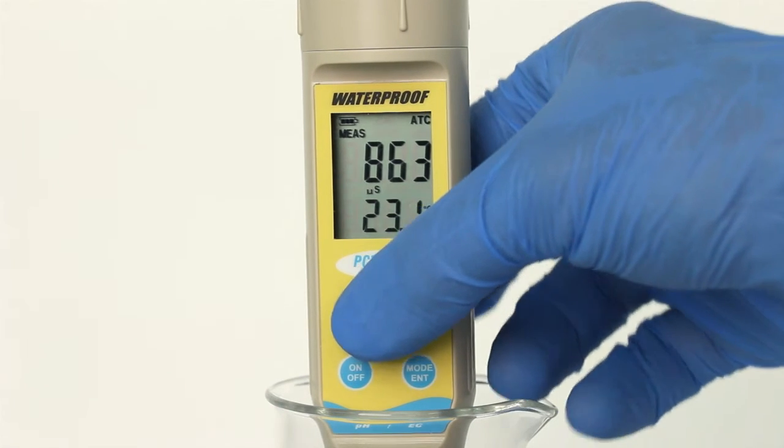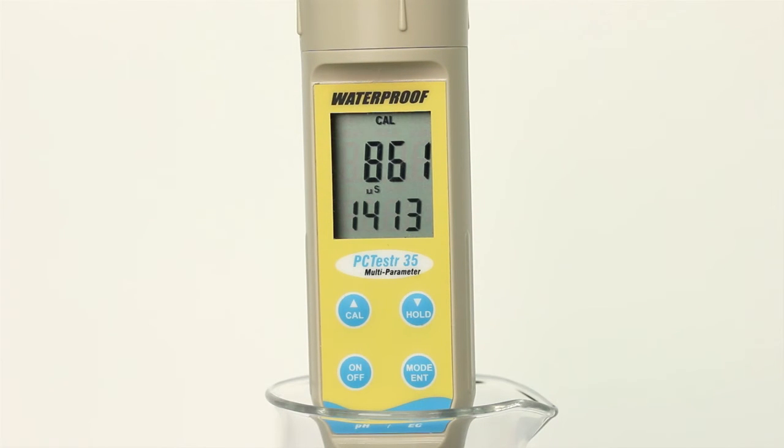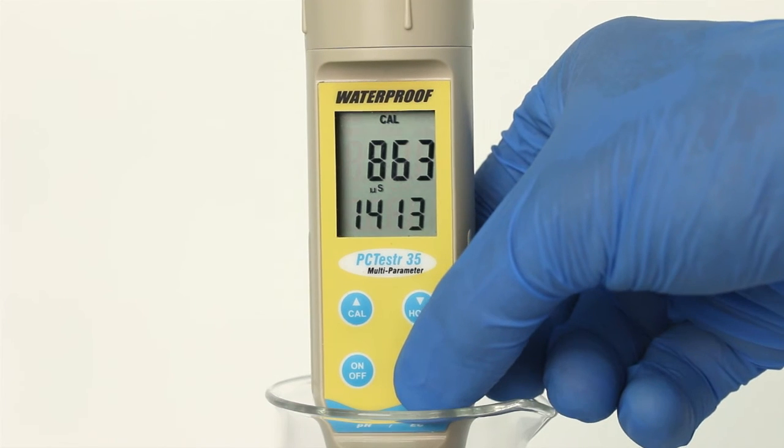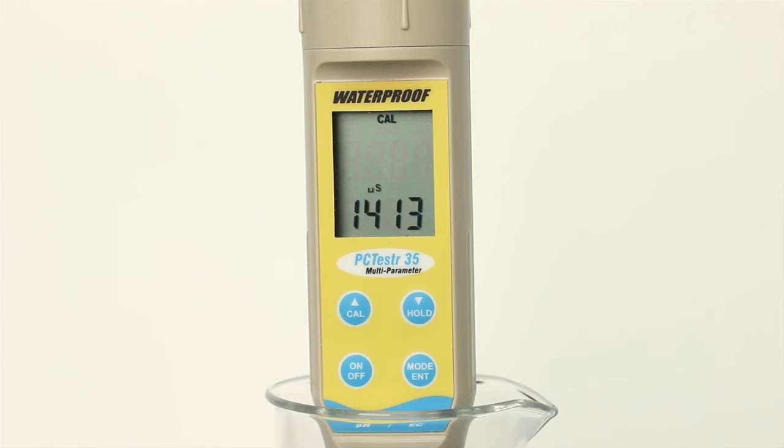The primary display will show the uncalibrated value, while the secondary display should search for and lock on the closest automatic calibration value. Allow the primary display to stabilize, then press MODE ENTER to confirm the calibration value. The primary value will blink briefly before returning to measurement mode. Repeat these steps as needed with additional calibration standards if desired.